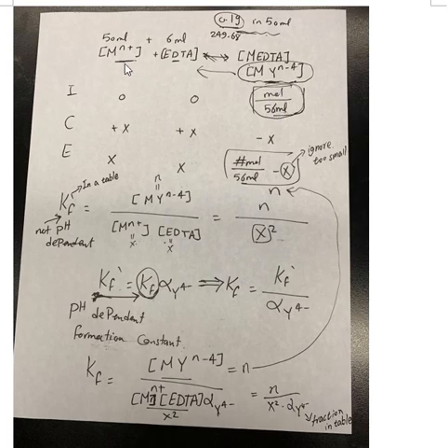How do we get this mole? We get this mole from this metal. It's a 1-to-1 ratio. We measure around 0.1 gram. Around, 0.1 is not an exact number. Around this number, 0.1 gram, and this number divided by molar mass. Molar mass, remember, it's a sulfate salt, and it also has water molecules in its hydrated form. Then you take the mass divided by molar mass, you get the mole, and then you use the same mole as the complex. Mole divided by volume, you get the molarity. You do the calculation conversion, and you get the molarity. And this is a starting concentration.